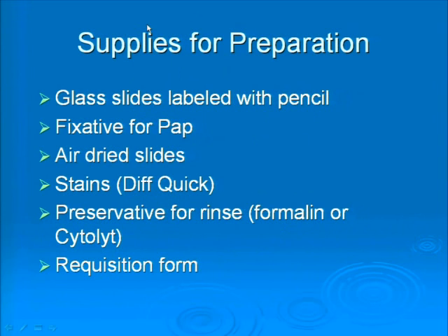So to do this, you're going to see everything when we go next door, but you have to have your glass slides. And remember, these glass slides are going to get dipped in alcohol for staining purposes. So anything that's a marker or a pen is going to wash off when you label it. So label your slides with pencil, okay?